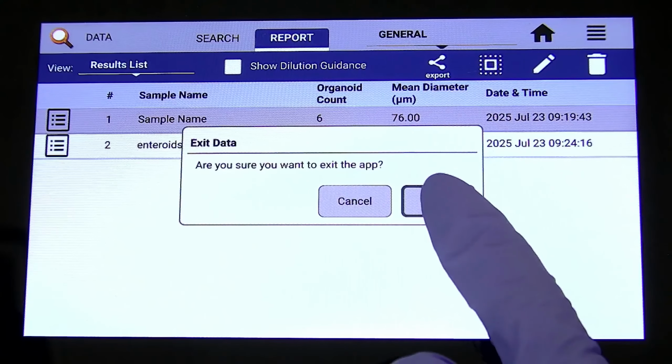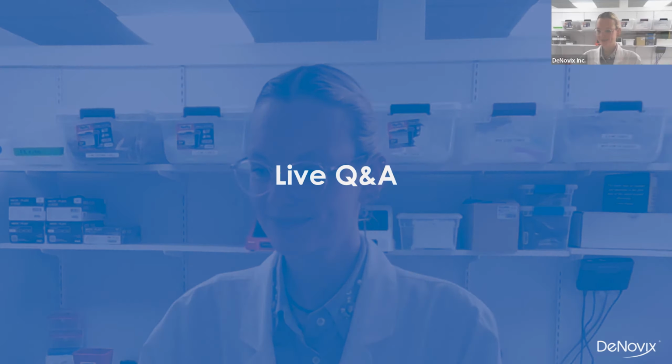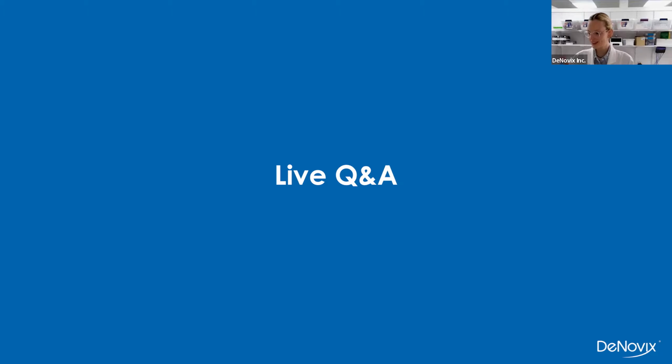Sweet. So I will hand this back on over to Andy to help with any other Q&A. Thanks, Grace. But quite a few questions have come in, so brace yourself.